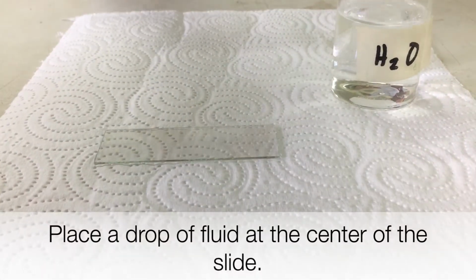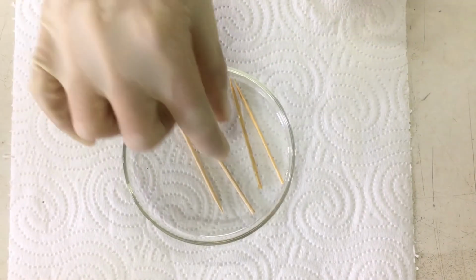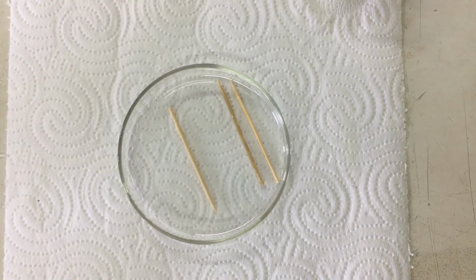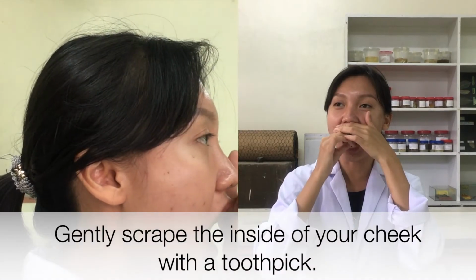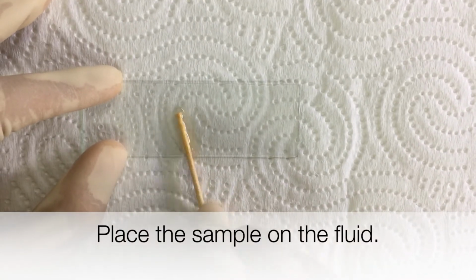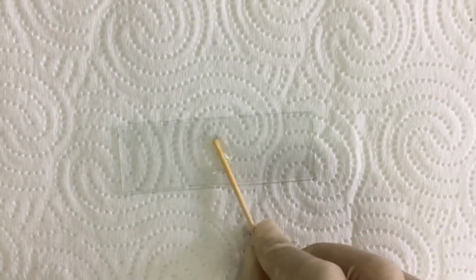Place a drop of fluid in the center of the slide. Obtain cheek cells by gently scraping the inside of your cheek with the non-sharp end of the toothpick. Once you have collected your sample of cheek cells, rotate the toothpick in the fluid to release the human cheek cells.